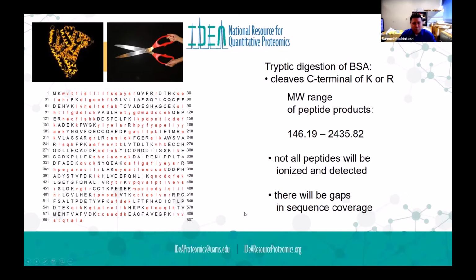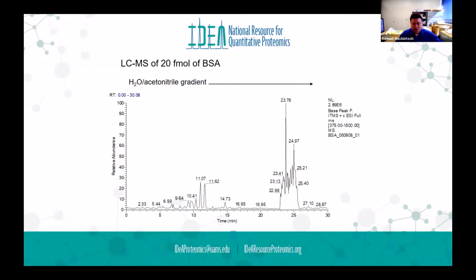You just blast the protein apart with a protease and then with a mass spectrometer, and you gather information on what you can still see. If you can get enough information to distinguish one peptide from any other possibility, then you can get usable data. So you don't need perfect sequence information to identify and quantify proteins, which is good.